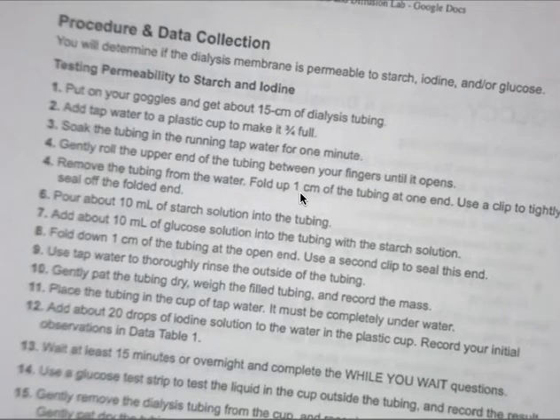12, add about 20 drops of iodine solution to the water in the plastic cup. Record your initial observations in data table 1. 13, wait at least 15 minutes or overnight and complete the "while you wait" questions. 14, use a glucose test strip to test the liquid in the cup outside the tubing and record the result. 15, gently remove the dialysis tubing from the cup and record your final color observations. Gently pat dry the tubing, weigh and record the mass.